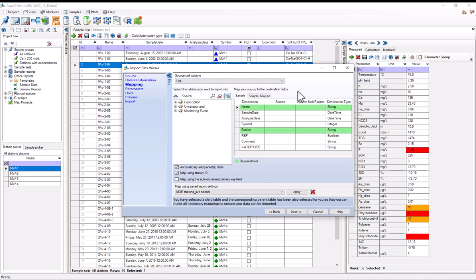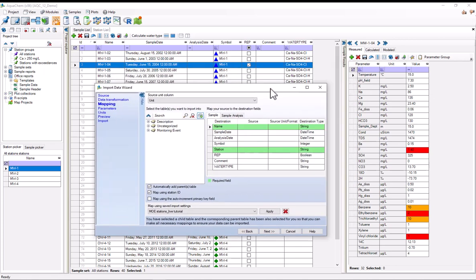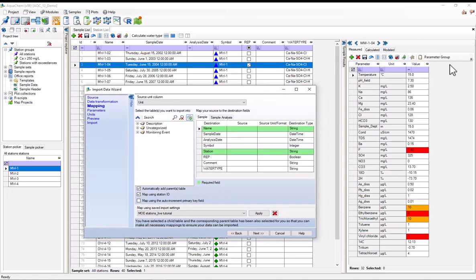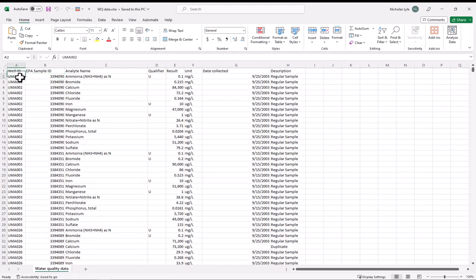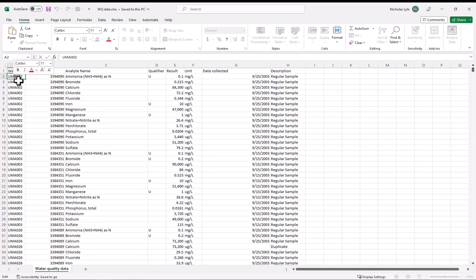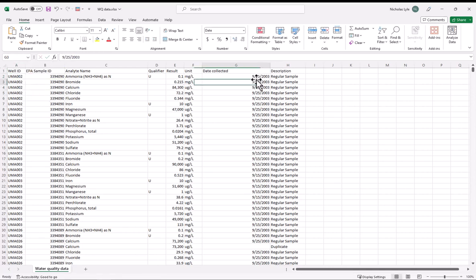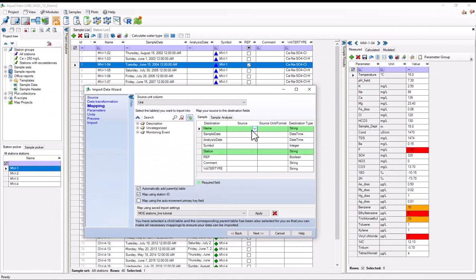And we also need to map the sample analysis table. So if you recall, the sample analysis table and the sample table are two different things. The sample table holds the metadata about the sample, whereas the sample analysis or the sample results pane actually holds the measured results. So I'll first map the sample table. And if I go back to my spreadsheet, the name is this EPA sample ID column, while the station name is the well ID. We also have a date collected column, so I'll map that as well.